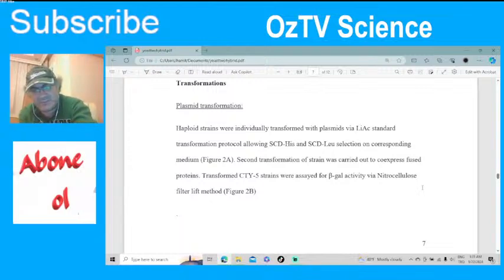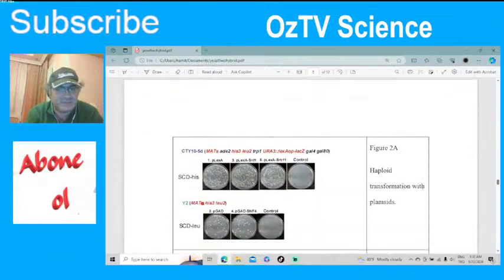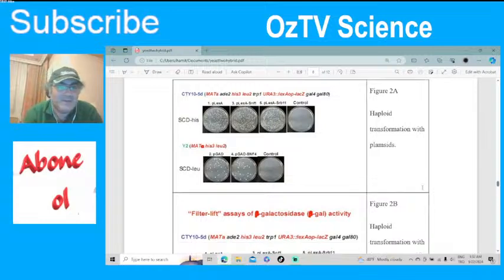I think we just plated the nitrocellulose with X-gal material, so the cells can change colors. So this is the combination. See, the haploid transformation with the plasmid. So this is one transformation.